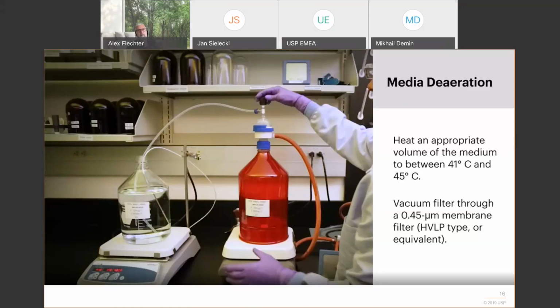And the boiling point of water would be the ideal scenario to degas medium. But nobody's doing that because waiting for the temperature to come down to equilibrate the medium again is not what you want. So what you can do is simulating the boiling point, because the solubility of gases is nearly zero at that temperature. So you simulate that procedure. And the other positive aspect is that once you transfer the media directly into the vessel, because you have a gravimetrical method to do that, or you put it first in a measuring cylinder, in a cold or room temperature measuring cylinder, you will actually cool down the medium quite a bit before it's actually placed into the vessel.